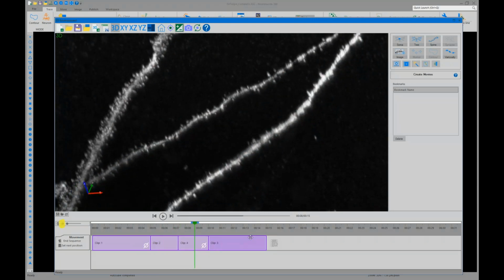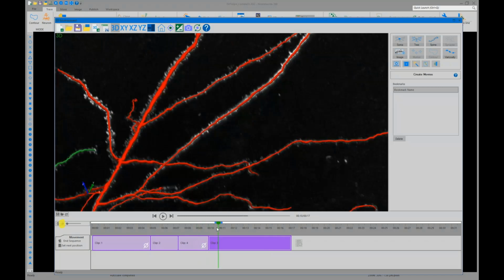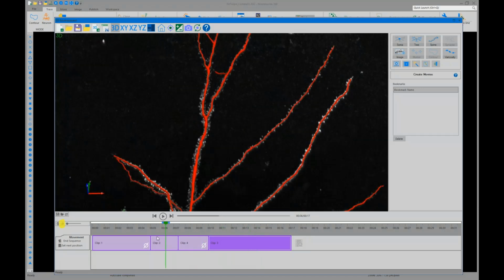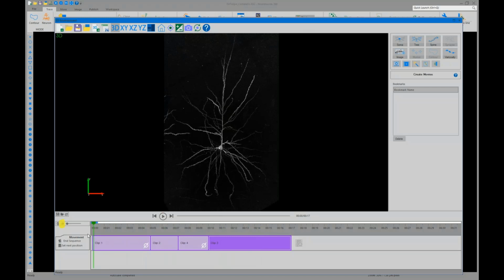And so these clips by default are going to be at 5 seconds, but that can also be changed. You can extend them longer, or you can make them shorter, and that will also help with the transition from one clip to the next. Yep. By making it longer, the transition will be a little slower, and by making it shorter, the transition will be a little quicker. Yep, and if you also want to have a nice, smooth, slow transition from one location to the next, you can put in intermediary points as well. That's right. That calculates a different vector in order to get to those different locations, and so that will help slow down the change in the viewpoint, the zoom.